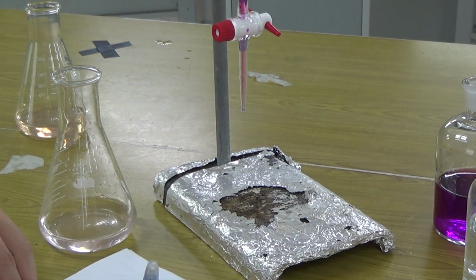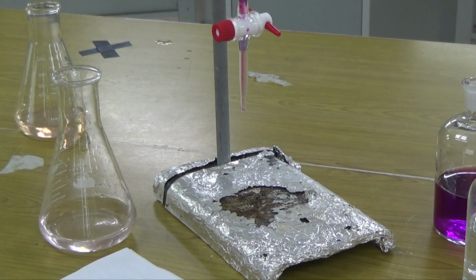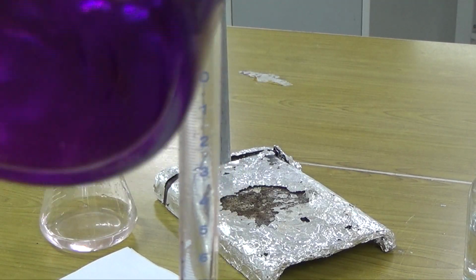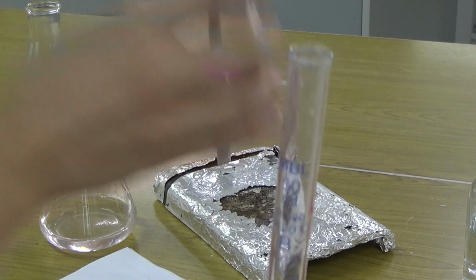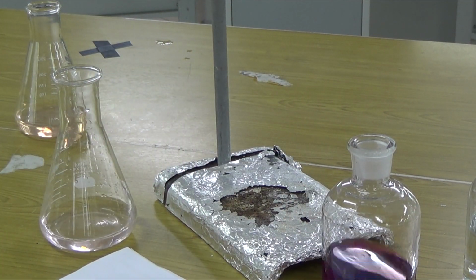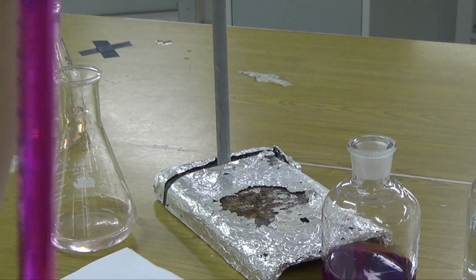So that was my second one. So it was 21.5. Let's do a third titration, which is going to be our second exact one. So I fill out my burette first. And I think I'm going to start from an easier number.